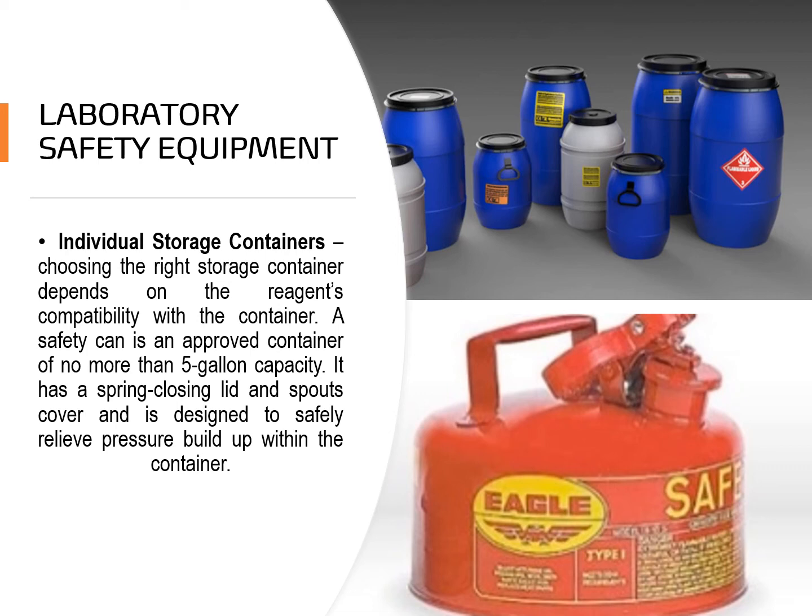So again, our individual storage containers must be properly labeled with the name of the chemical, the hazard associated with that chemical, and the NFPA color-coded symbol to give us an idea of the nature of the chemicals stored in that container.